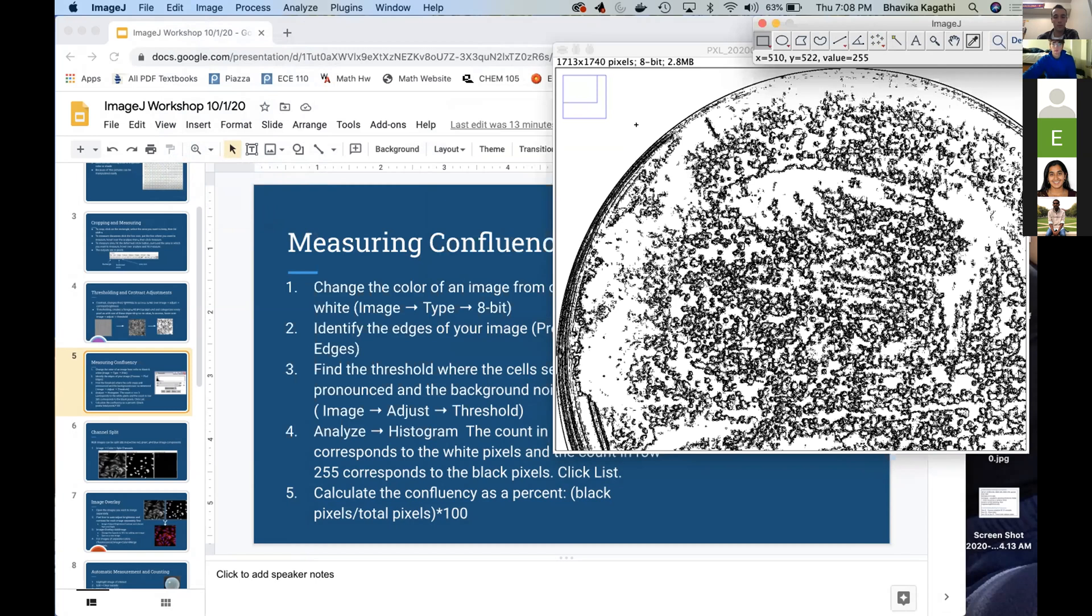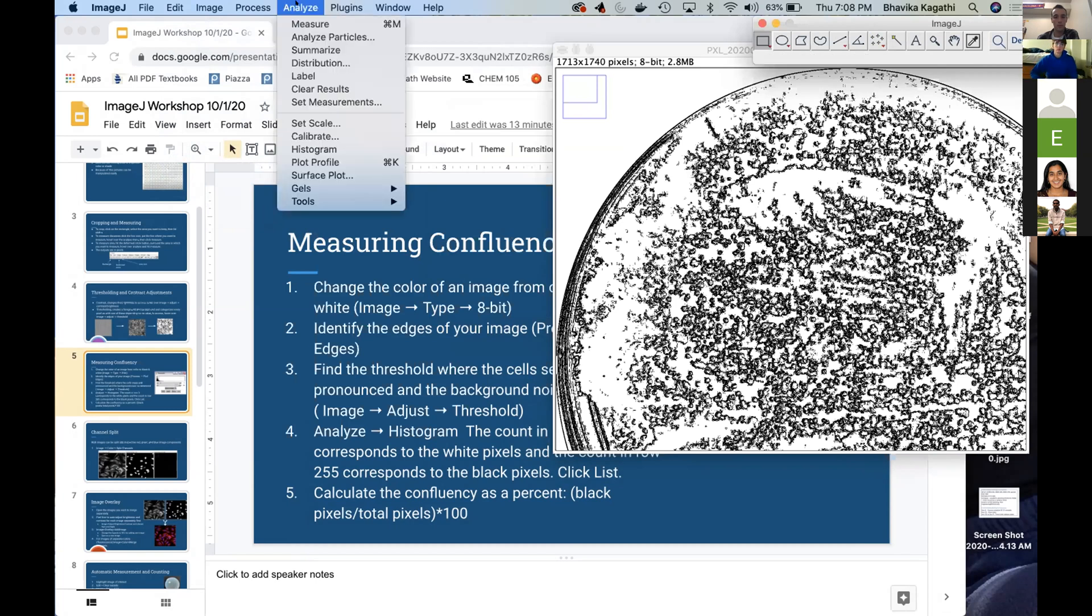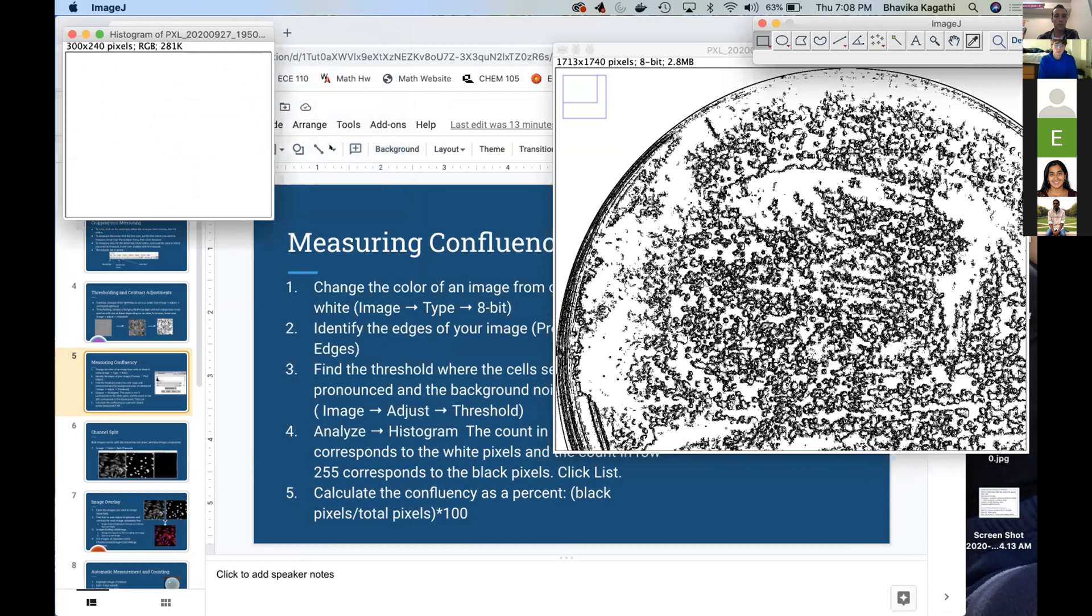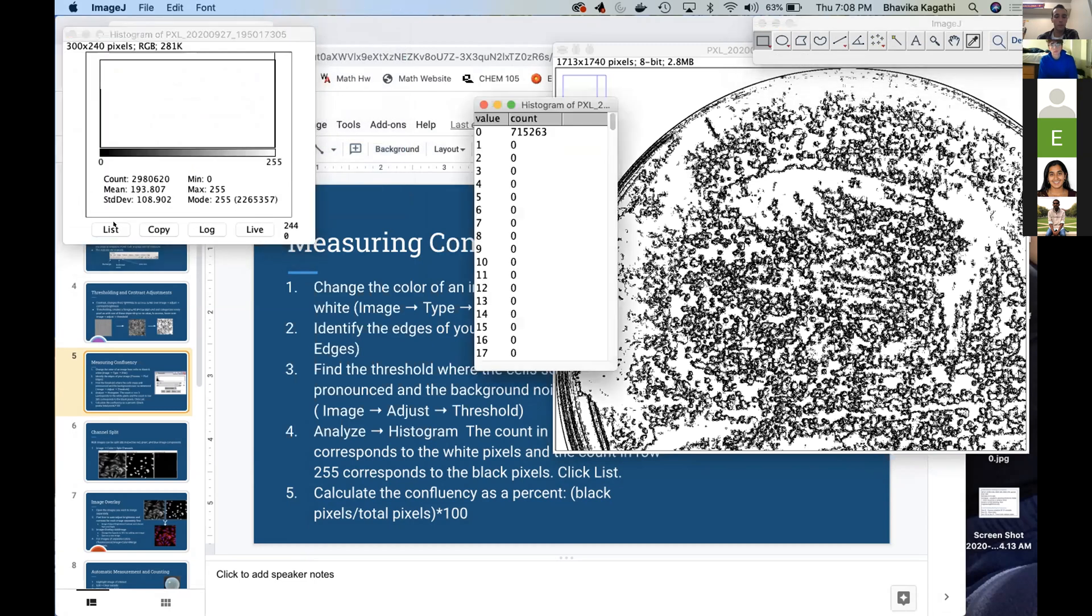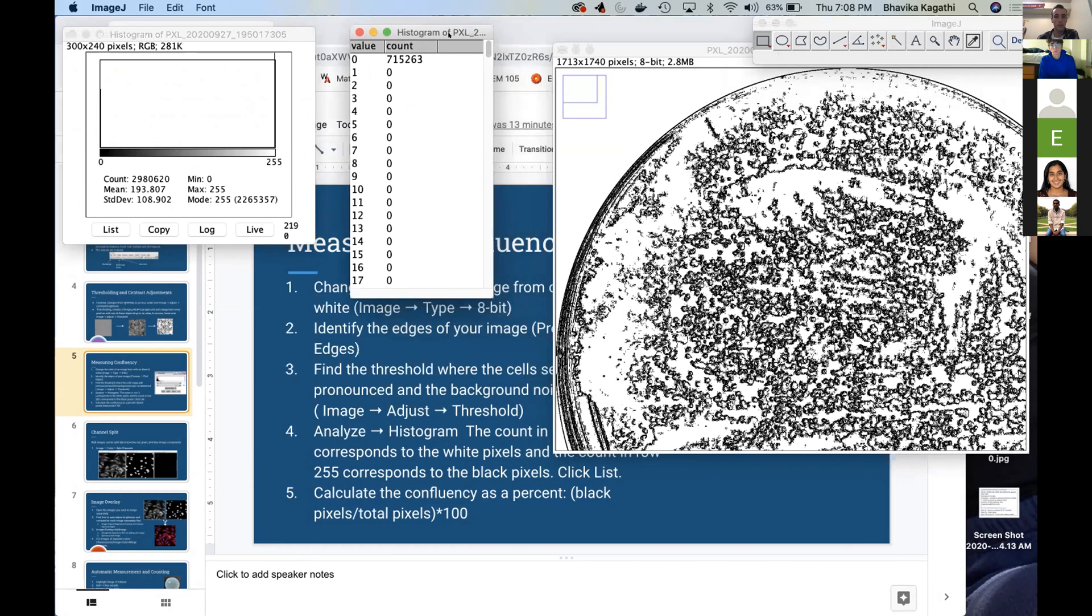So we're going to go to Analyze, Histogram. And then here we're going to click List. And so essentially what the list does is give us two numbers.